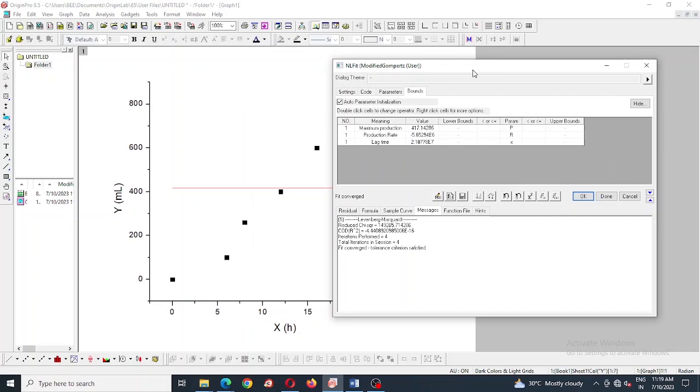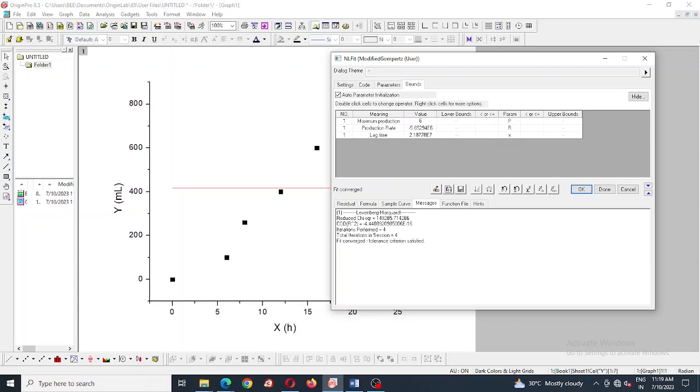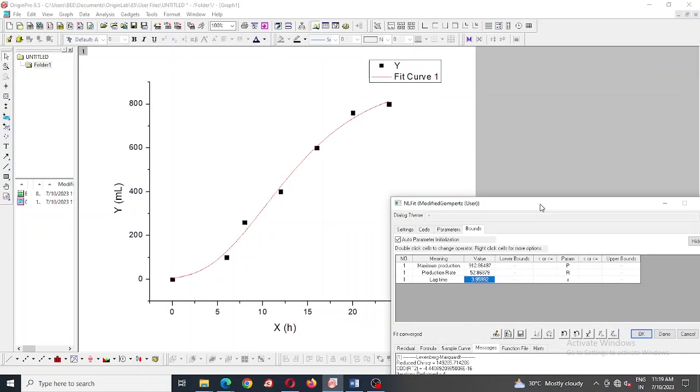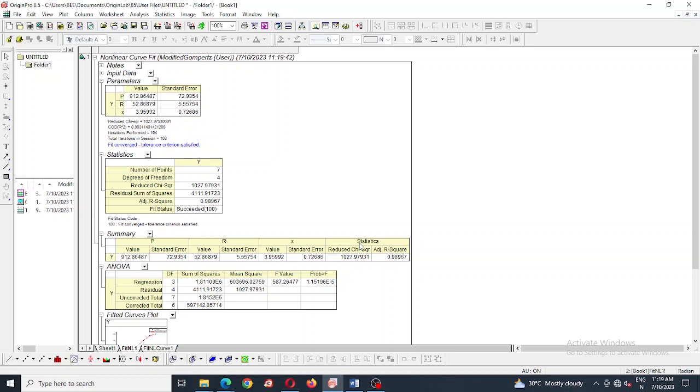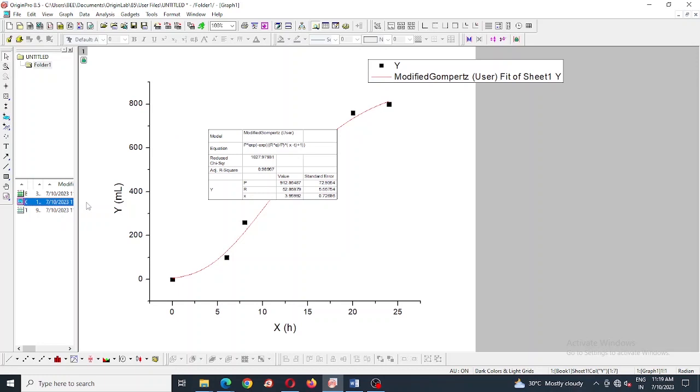And here some values have come. I have to add those values to our expected values and next press. It looks like our curve fitting has done so we are going to finish it and okay. And this is the result we have obtained - 912 is maximum hydrogen production, 52.8 is production rate and the lag time is 3.9.